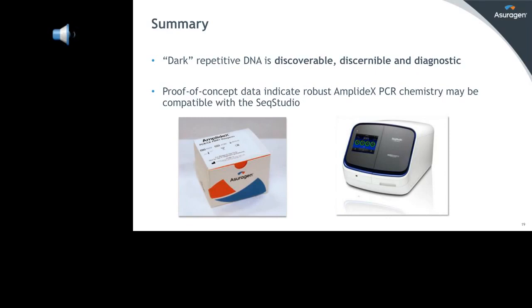And this actually has a benefit: improved sensitivity, which is ideal for, say, full mutations of FMR1, where when you go beyond 200 repeats, there's no indication of genotype-phenotype correlations that are useful. So this pileup can be very beneficial for the assay because it can increase that sensitivity.